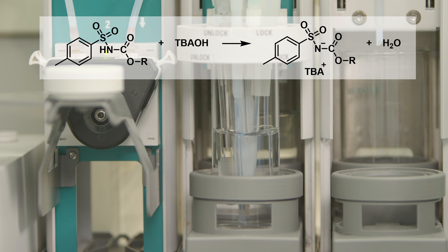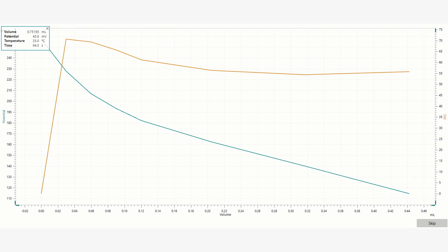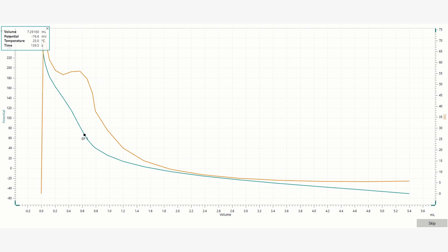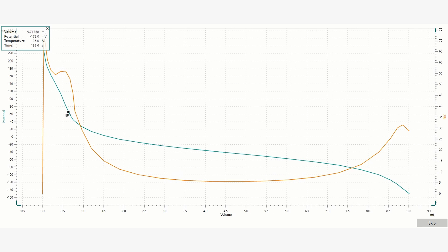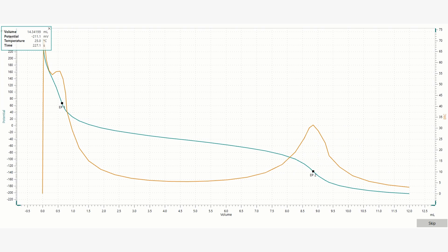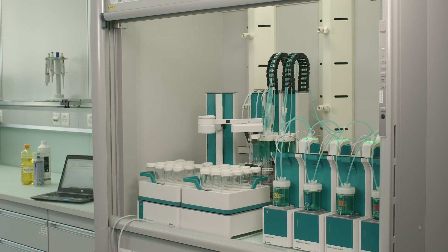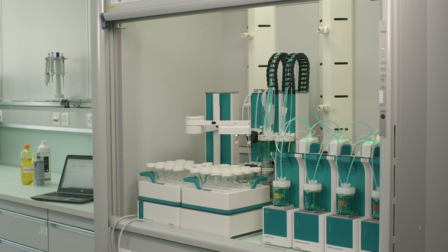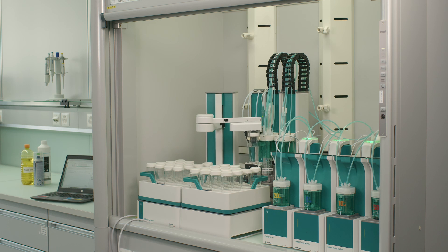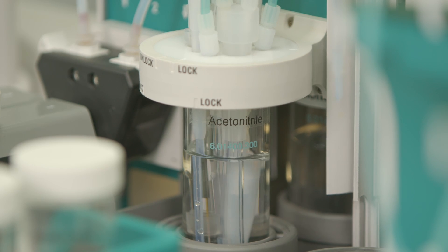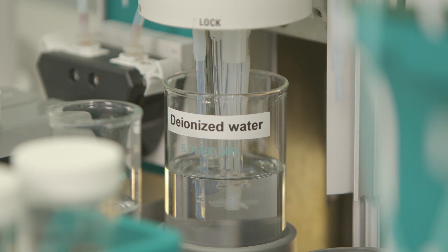Finally, the acidic carbamate is titrated with tetrabutyl ammonium hydroxide, also known as TBAOH. During the titration, two equivalence points — EP for short — are observed. EP1 corresponds to the acidic species in the sample. EP2 correlates to the acidic carbamate. The difference between EP2 and EP1 is used to calculate the hydroxyl number of the sample. After the titration, the sample beaker is automatically emptied and the titration head is cleaned with acetonitrile. The electrode is then rehydrated in deionized water.